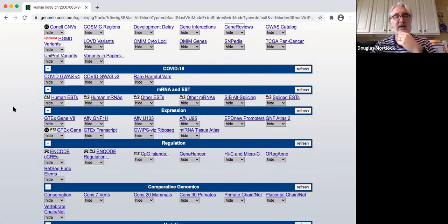You won't find a lot of easy links to RNA sequencing information, usually because that stuff is so dense that usually you don't want to look at all of the RNA-seq data from a specific source. And by the way, then you would have to choose the tissue source too, the cell line. So it gets really complicated really fast.